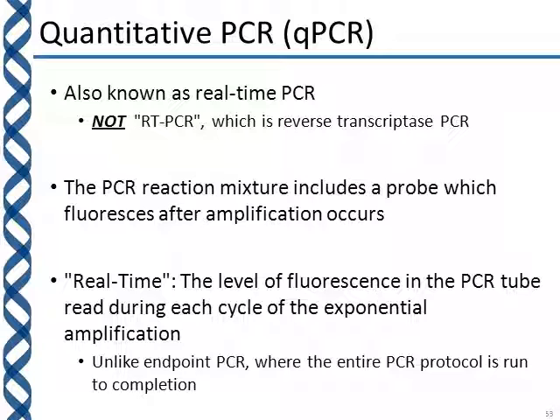So, okay, in all seriousness, qPCR incorporates a fluorescent probe into the PCR mixture.